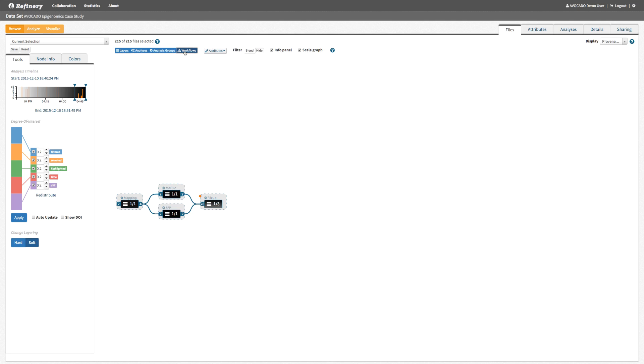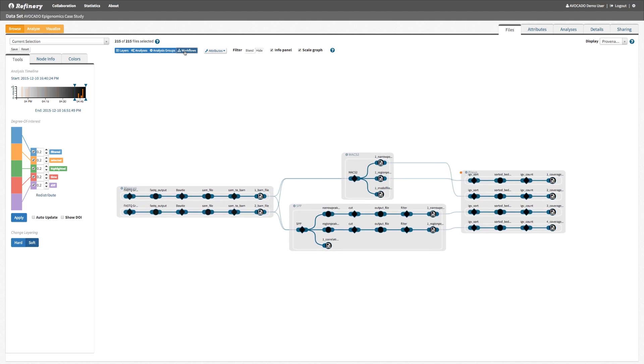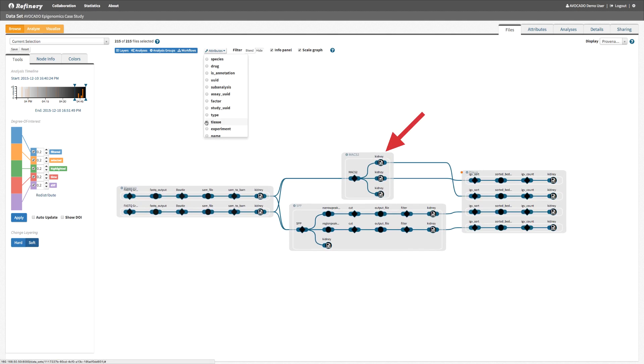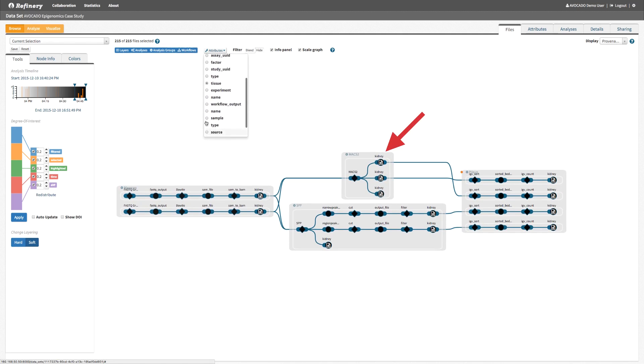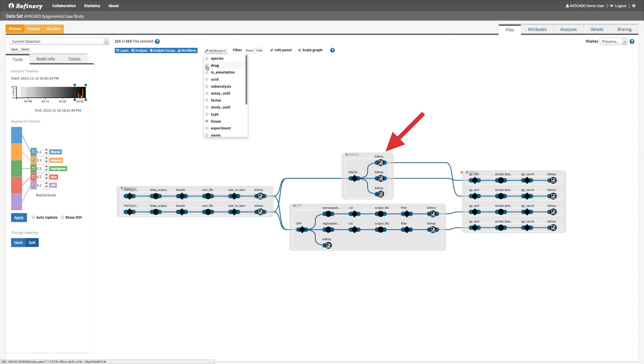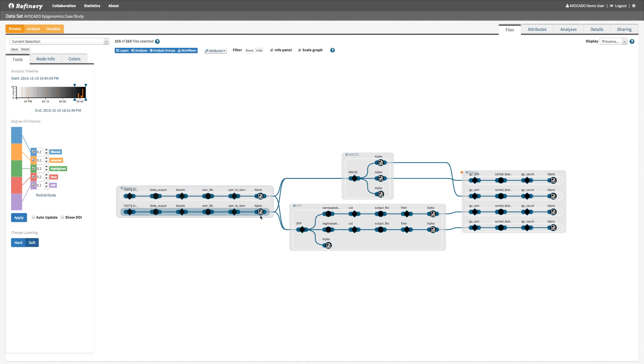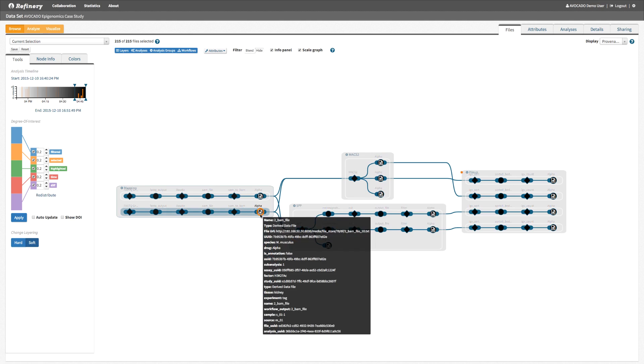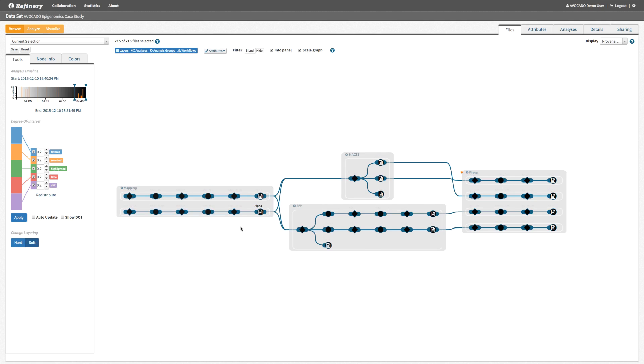Now we can expand the remaining aggregated nodes to see more detail. We can map different metadata attributes as node labels. Hovering over a node shows all metadata associated with the node.